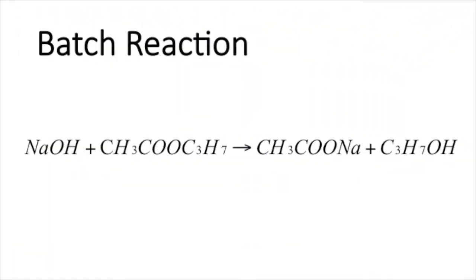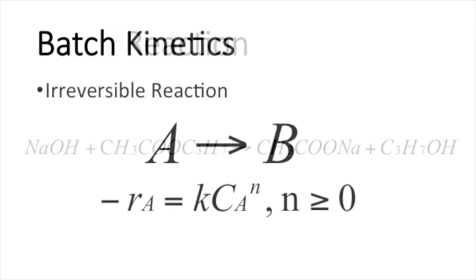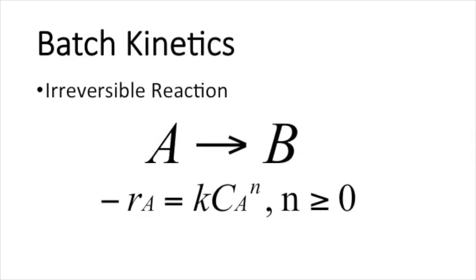Theory. This experiment studied the reaction kinetics of a simple homogeneous liquid phase system between isopropyl acetate and sodium hydroxide, which is an example of saponification. Kinetics is the study of how fast or slow the concentrations of reagents change during a chemical reaction and the factors that interfere with this speed. A batch experiment was first implemented to monitor the conversion over certain time intervals.